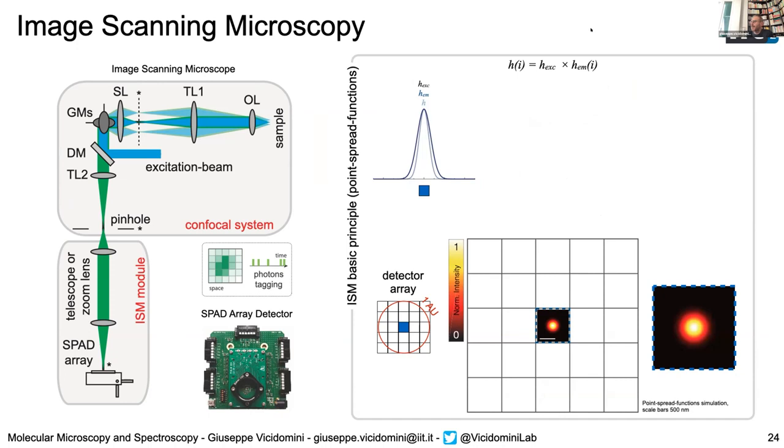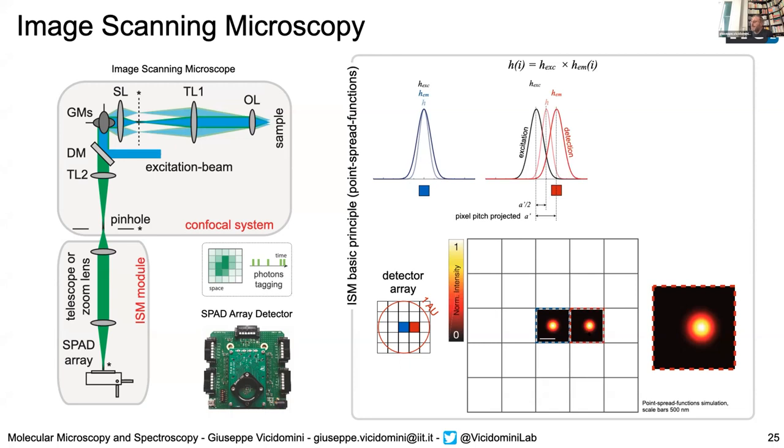In a confocal microscope, the point-spread function can be calculated by the multiplication of the illumination point-spread function, the diffraction limited spot, by the emission point-spread function, the diffraction limited spot in the emission. If we assume that both the excitation and the emission are Gaussian distributed, and that the Stokes shift is not relevant, then we have a multiplication of two Gaussian functions that ends up as a Gaussian function positioned exactly in the same place, but with a sigma that is reduced by a square root of 2.